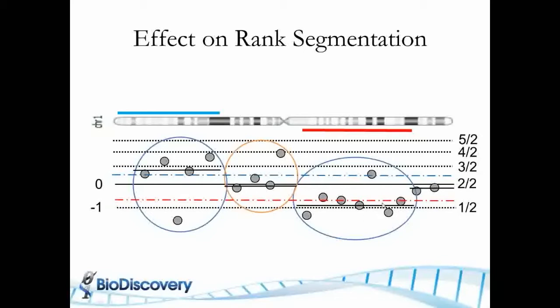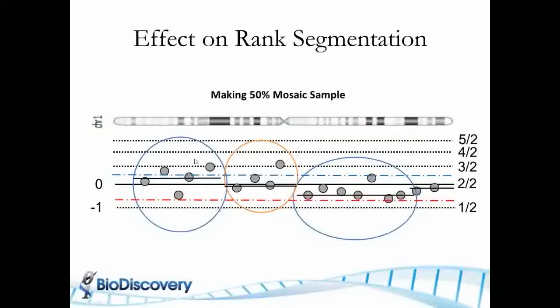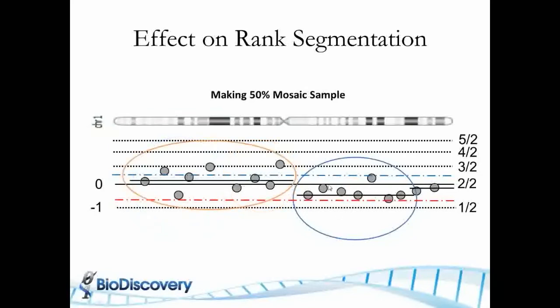Now if this is a pure sample, but now if it's cancer and it is half normal stromal contamination, what happens is these probes get squeezed down and as they get squeezed down using the rank segmentation or CBS algorithm, the distribution of the probes here no longer become significantly different from each other.